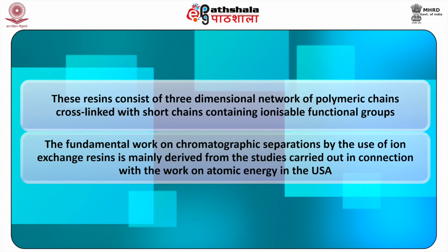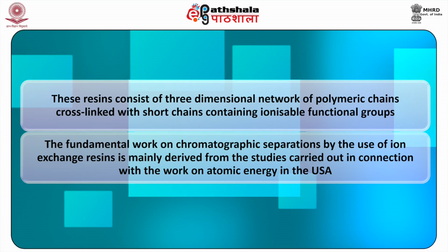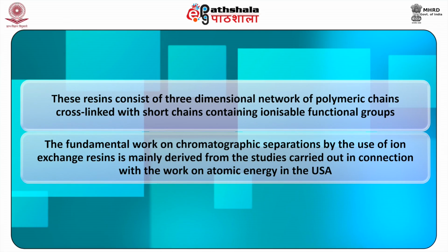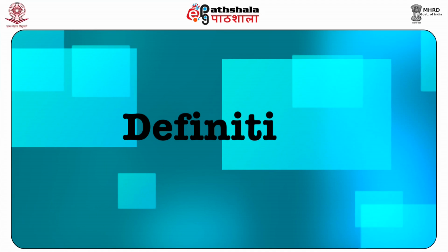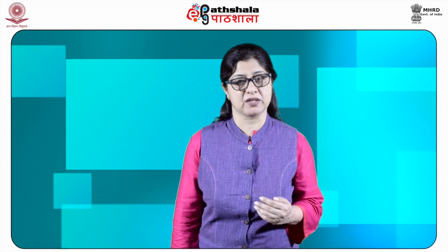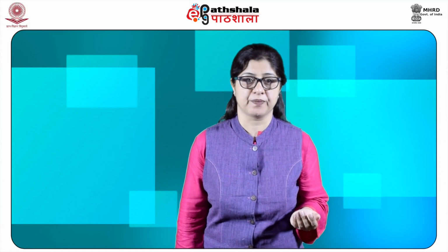The fundamental work on chromatographic separations by the use of ion exchange resins is mainly derived from the studies carried out in connection with the work of atomic energy in the USA. Definition: ion exchange may be defined as a reversible reaction in which the free mobile ions of the solid, called ion exchanger, are exchanged for different ions of similar charge present in the solution.